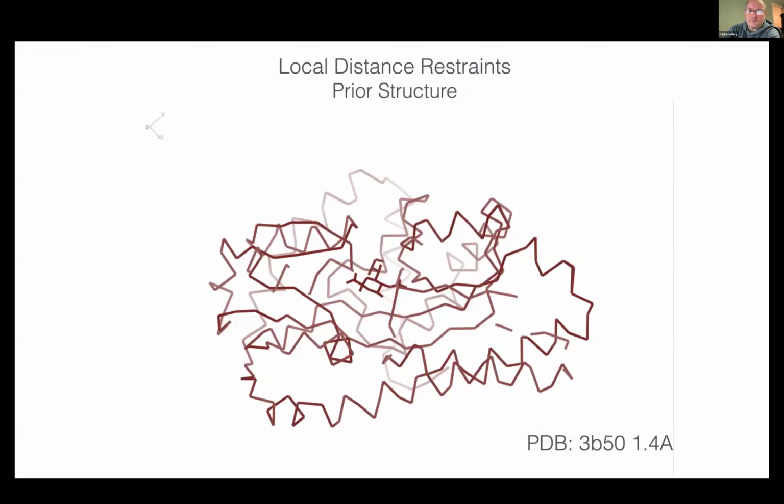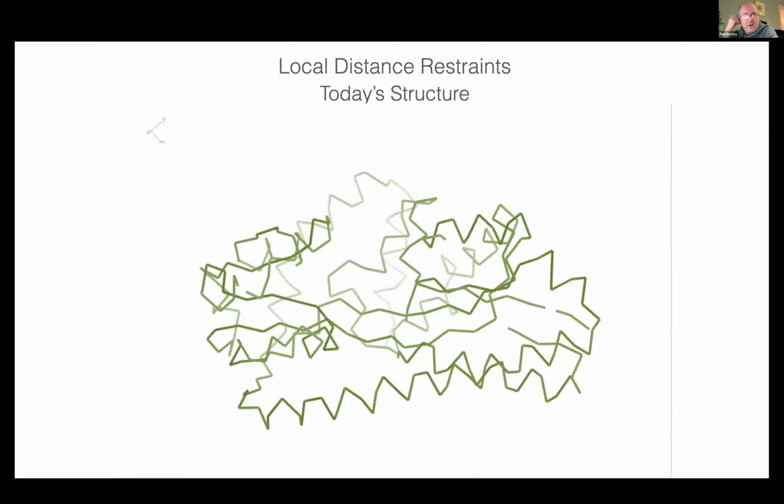So the idea in his thesis was crystal structures where you have a high resolution form, the ligand bound form, and then this weak structure is a low resolution map that doesn't have the ligand, but you want to use the information from the high resolution structure to inform the low resolution refinement, and we do that with local distance restraints.